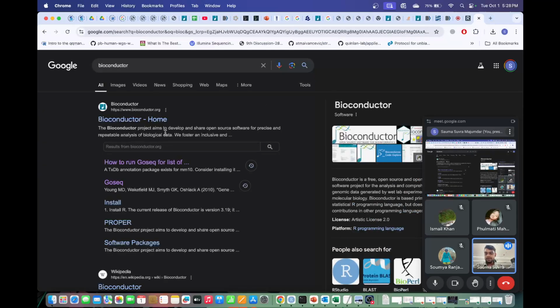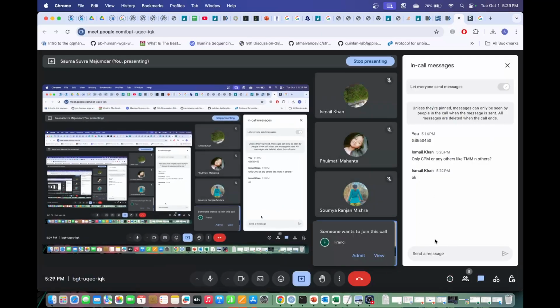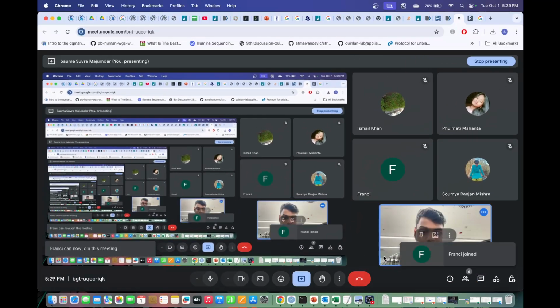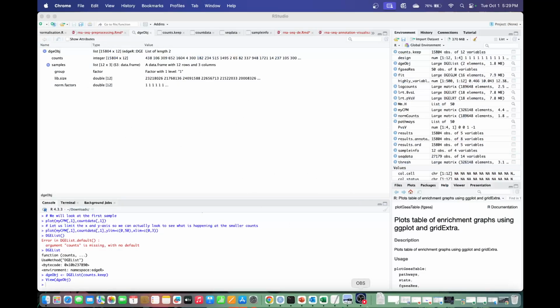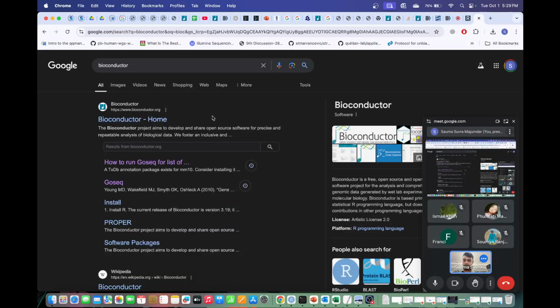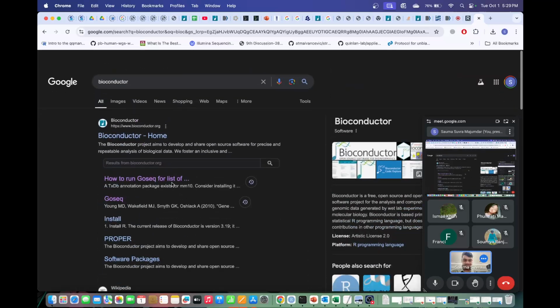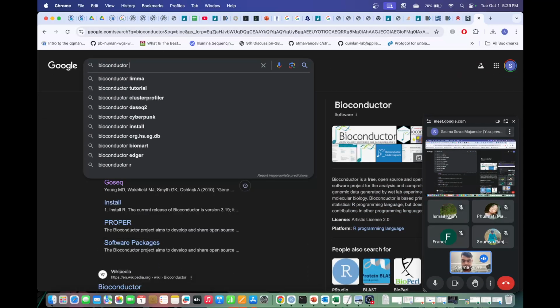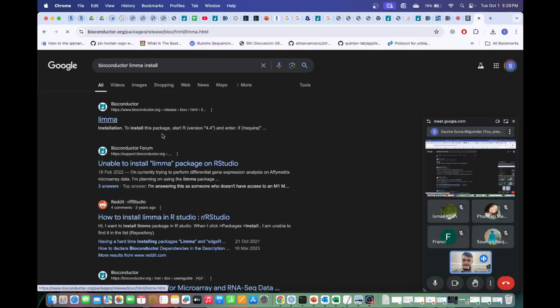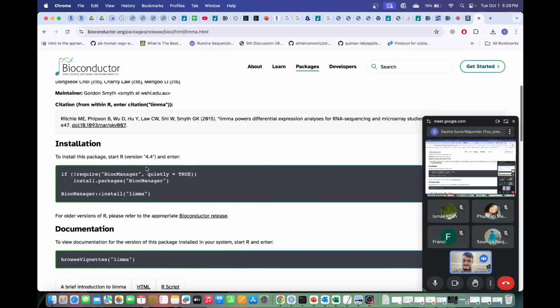Say for example you want to install limma. You go to this website and you first have to install Bioconductor.